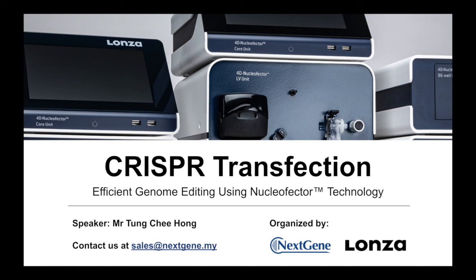All right, thank you, Chee Hong. So we have another question from Ahmad Basli Ramzi. Hi, many thanks for such an insightful talk. Could you share if the RNP method has also been used for Cas12 protein?